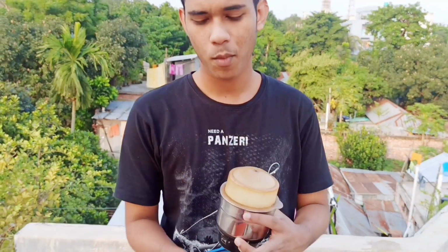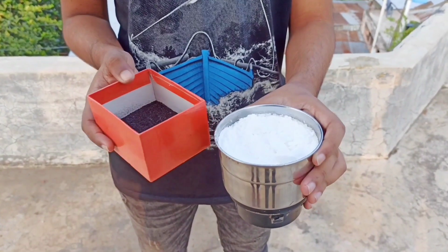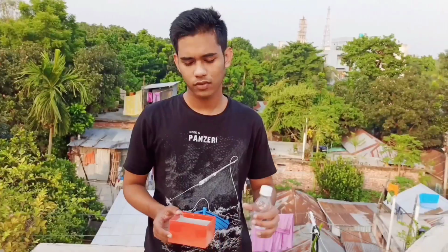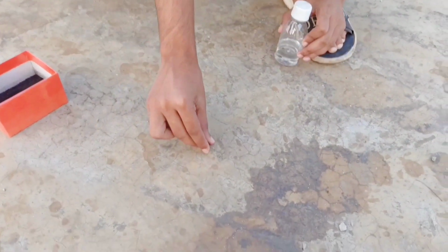So alright guys, as you can see, I have here potassium permanganate and I also have sugar powder. So what are we going to do? Let me show you something. Alright guys, first let me show you something. I'm going to take some potassium permanganate here.